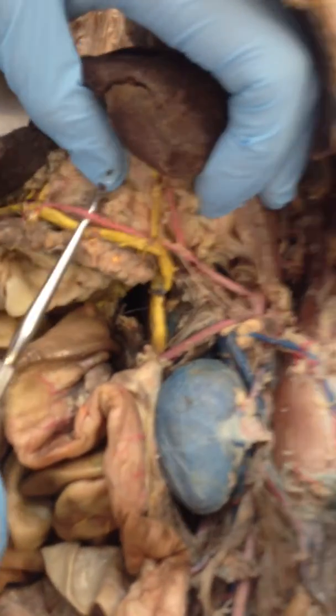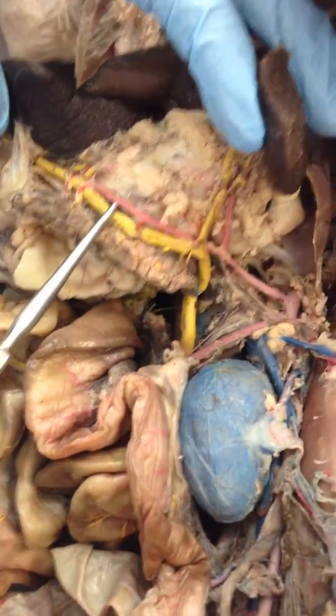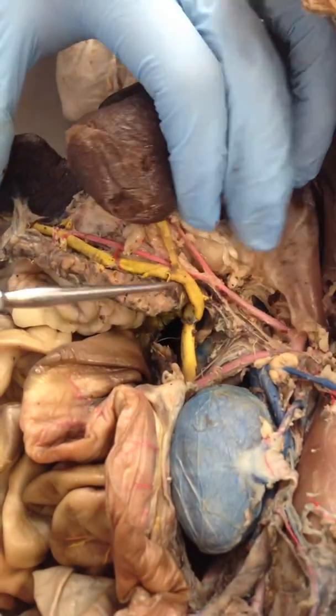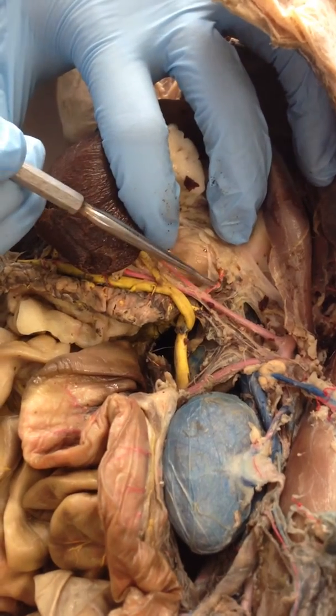Okay, so splenic, and then this is also going to the spleen. So this is also splenic. So both of these are the splenic then. So this is the celiac trunk. This over here is the hepatic.